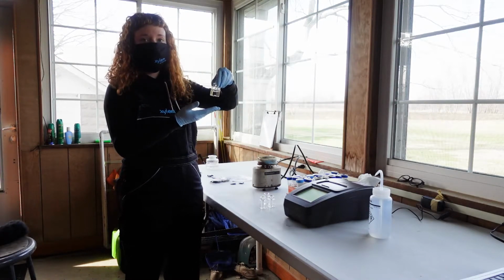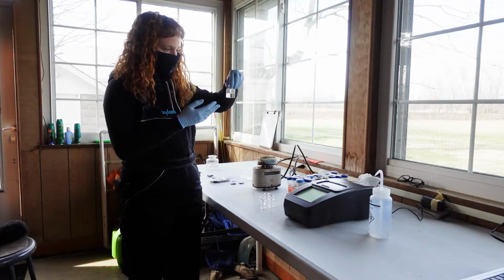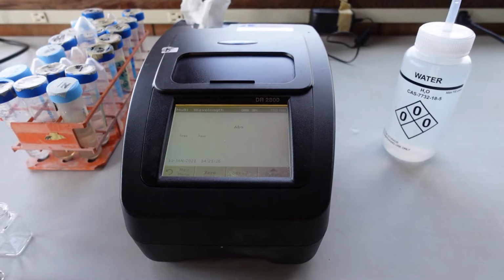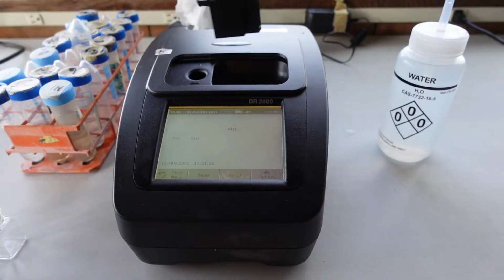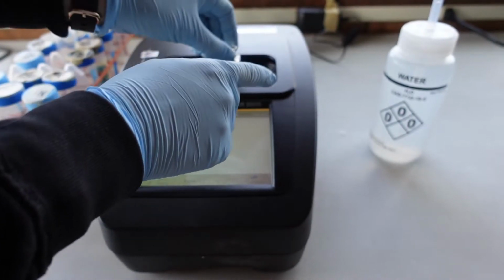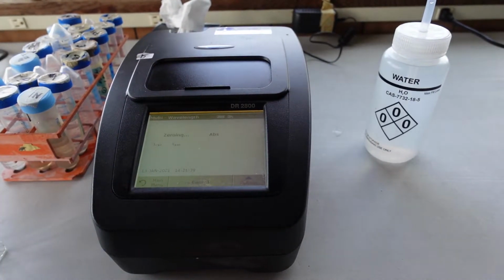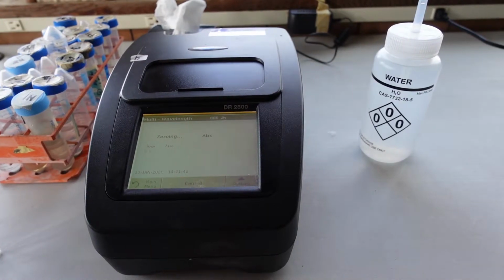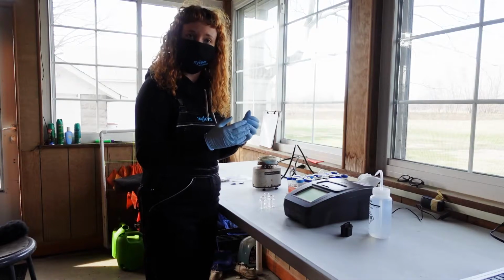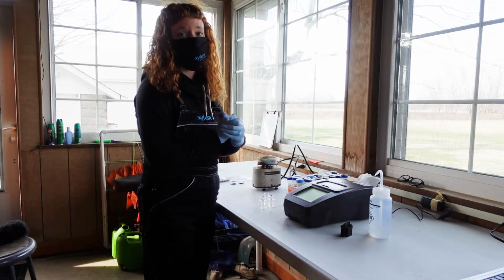So for my zero, in one of these cuvettes, labeled 628, I have DI water. And I'm going to use this DI to tell the instrument what a zero concentration looks like. All right, so I will open the instrument. I will remove the light shield, place it in the direction of the optical path, close, and then press 0. All right, and so the instrument says 0 absorbance units, and what that means is it's read at the absorbance point and calibrated that to be 0.